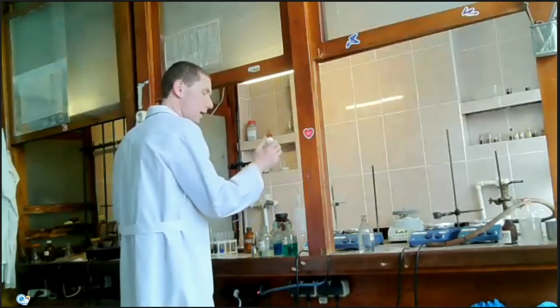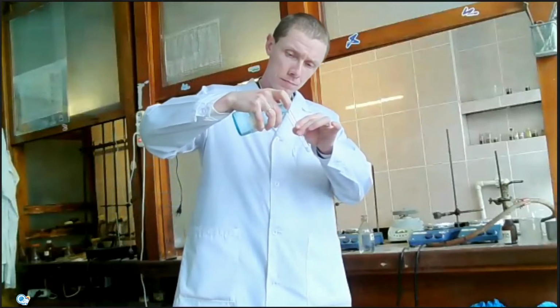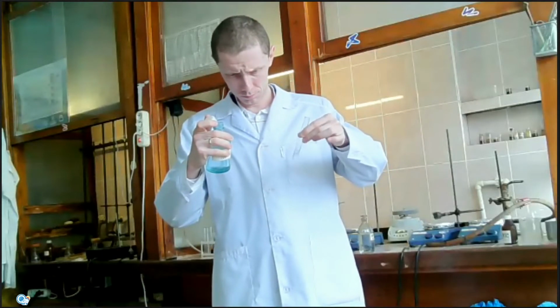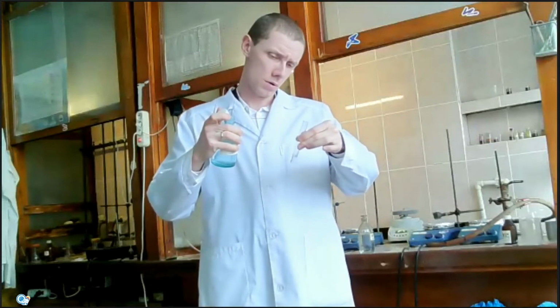But if I add the ammonia solution, this precipitate dissolved because of formation of complex.